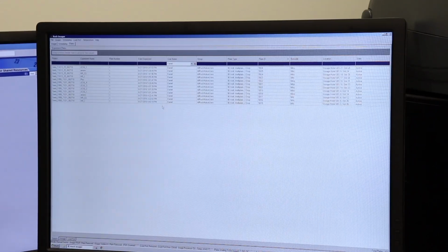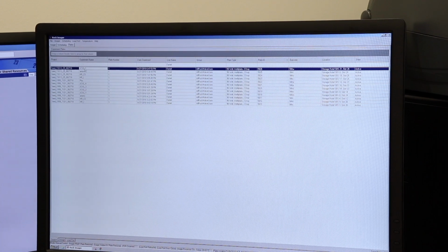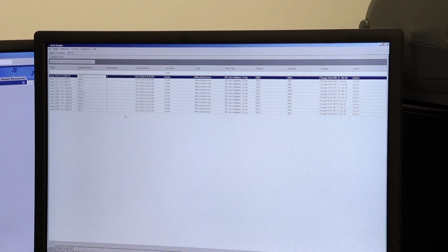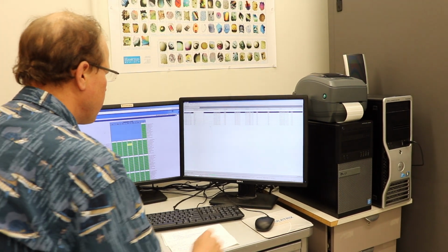And the plates for that search will come up. So if you just want to remove one plate, highlight it, move plate to Load Port Hotel, and the robot will come pick it up and bring it to the Load Port Hotel.